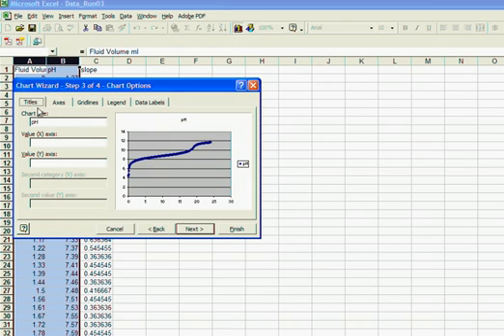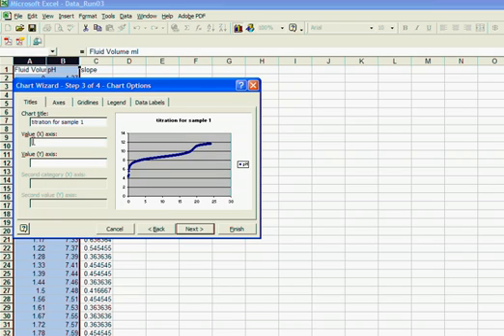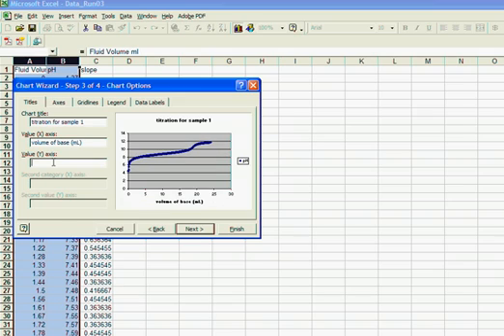Now I can put some titles in. My chart title I'm going to call it titration for sample one. My x-axis I'm going to label with volume of base and milliliters. My y value is the pH.